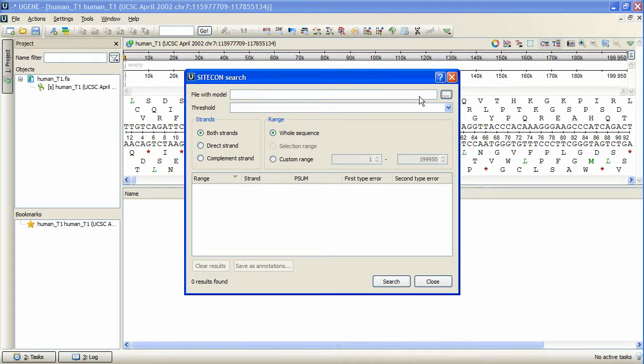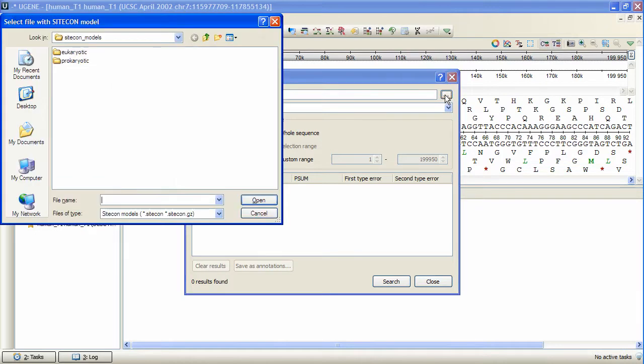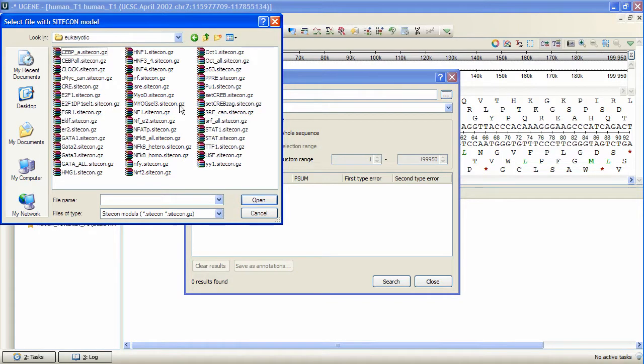Let's specify the model to search with by pressing Browse. Here is eukaryotic and prokaryotic profiles groups, which contain pre-built profiles. Let's choose one of them.